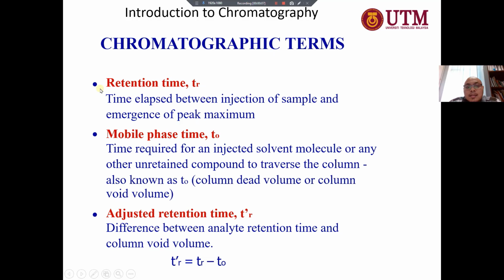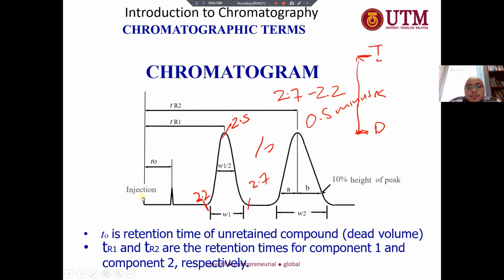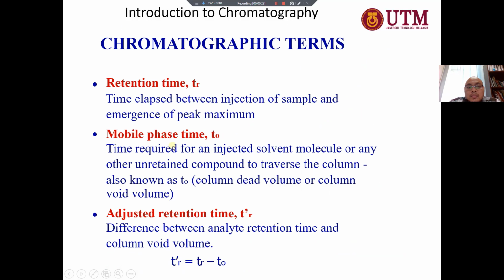Next, the chromatographic terms. I think we already discussed the TR or RT, the retention time: the time elapsed between injection of sample and emergence of the peak maximum. It means from the injection process at 0 until it emerges. That is what we call the retention time.